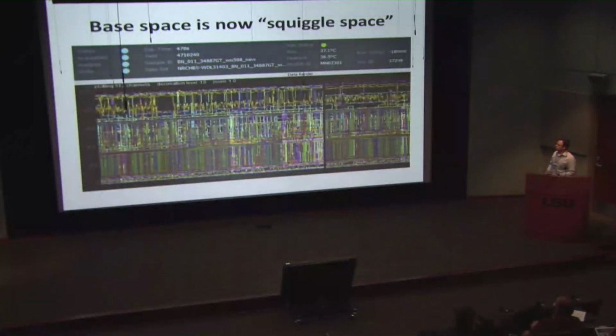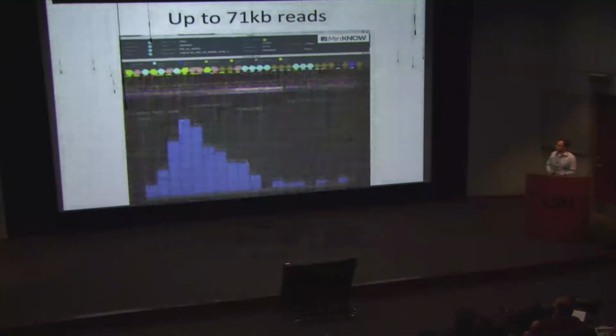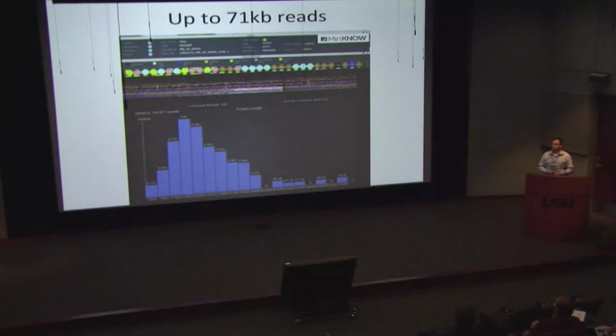But what's amazing is it's gotten better much faster than a lot of their technologies. It changes almost every 2 weeks. And now we can see about 71 kilobase reads, even at this point fairly routinely. You get very, very long reads, very, very fast, within a few hours. And sample prep is really the biggest bottleneck in speed. So it's kind of an exciting time to think of a suitcase sequencer. You could walk in anywhere and sequence something as needed and move around to the next spot.